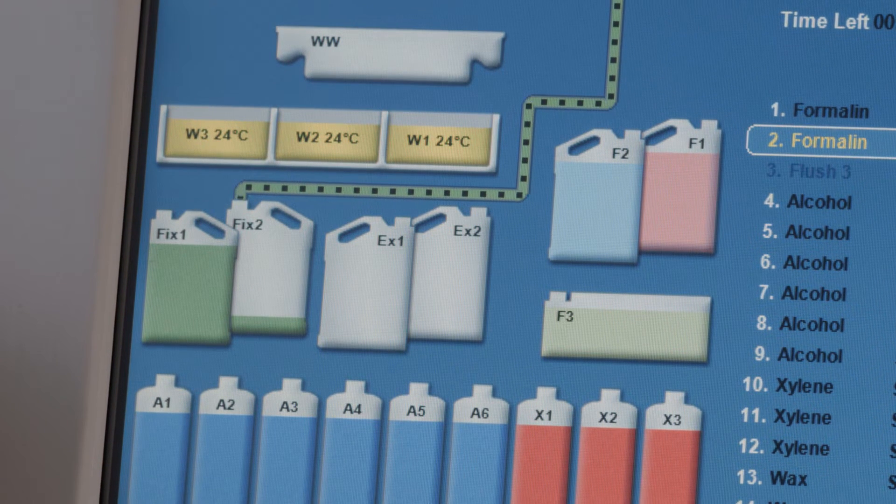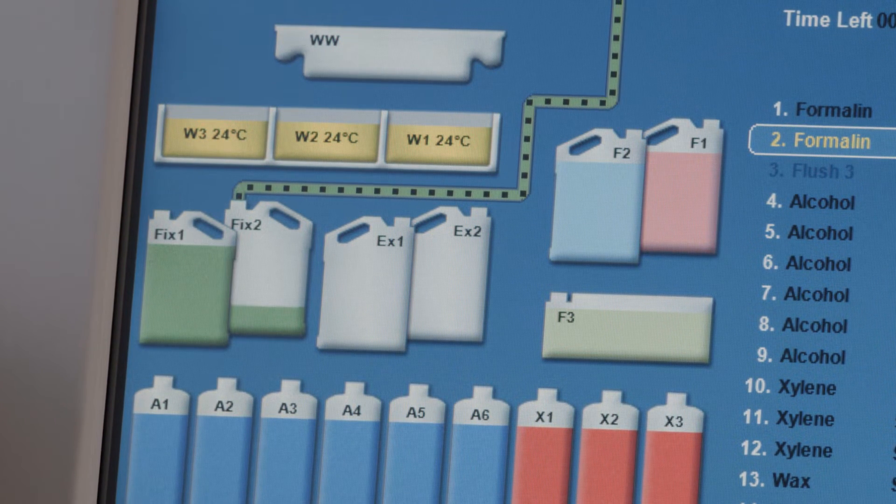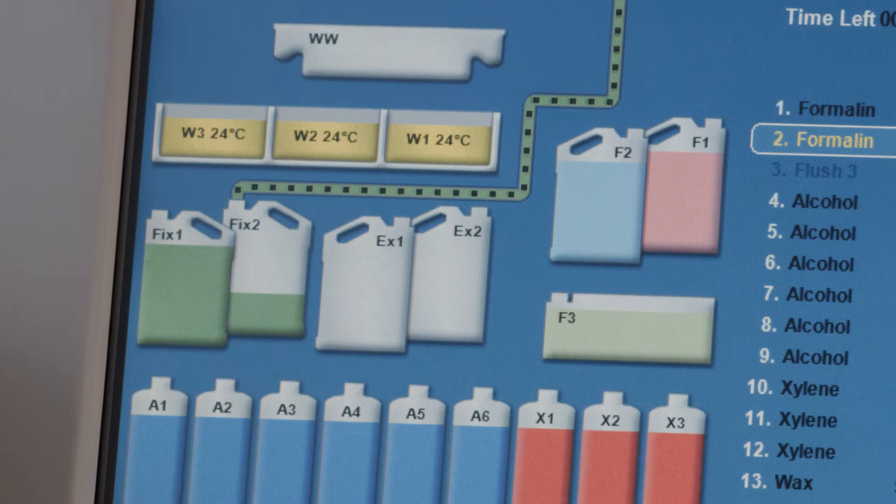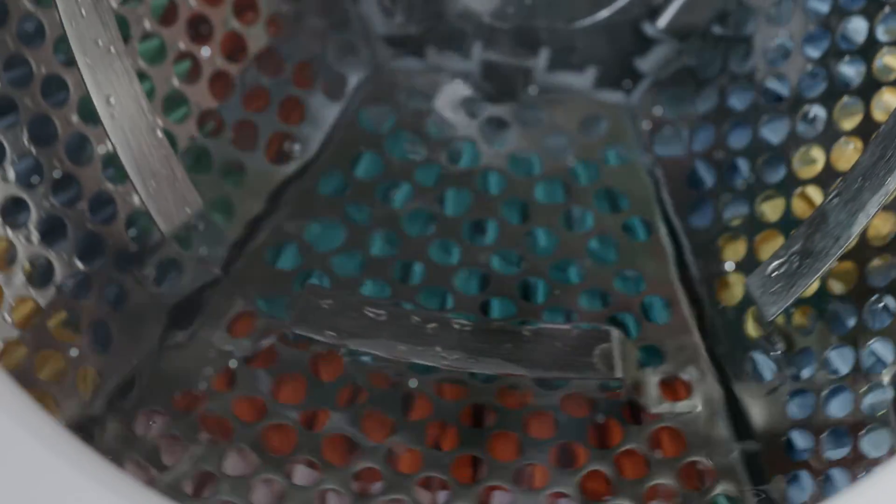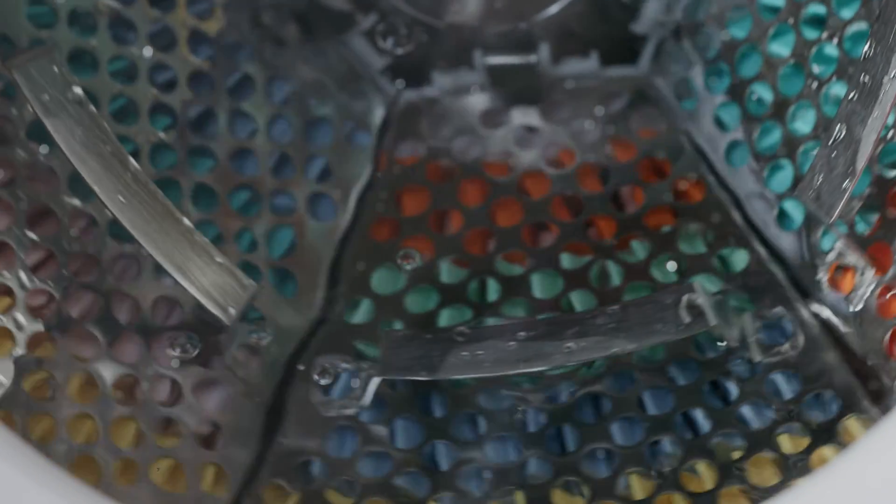When needed, reagent rotation occurs on its own during your processing runs. The system automatically introduces fresh reagents, saving you valuable time during your workflow and reducing maintenance time.